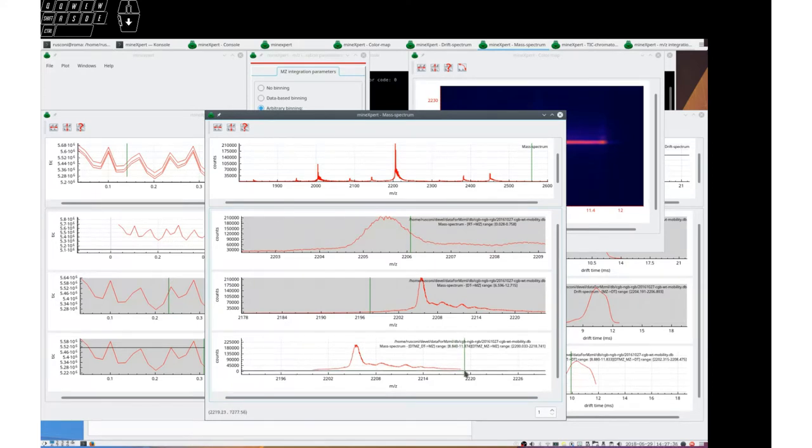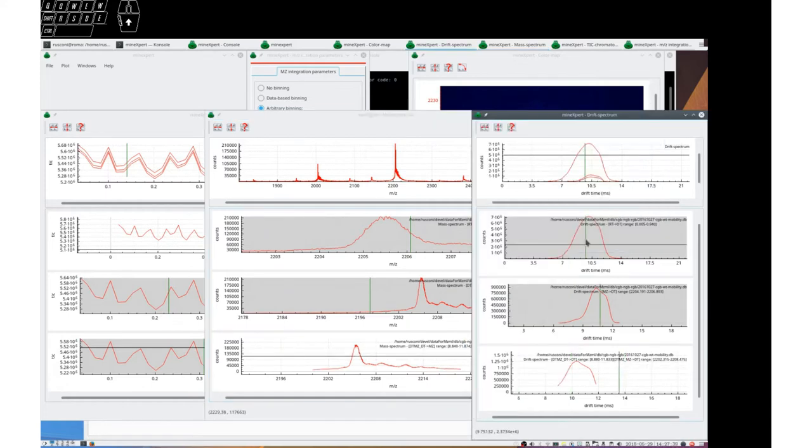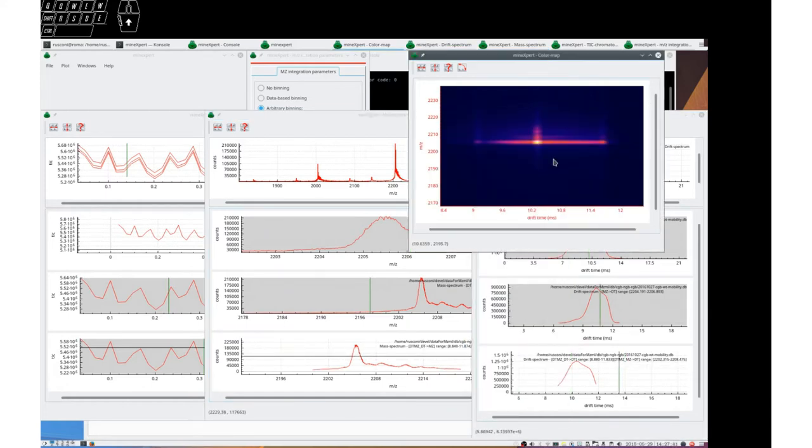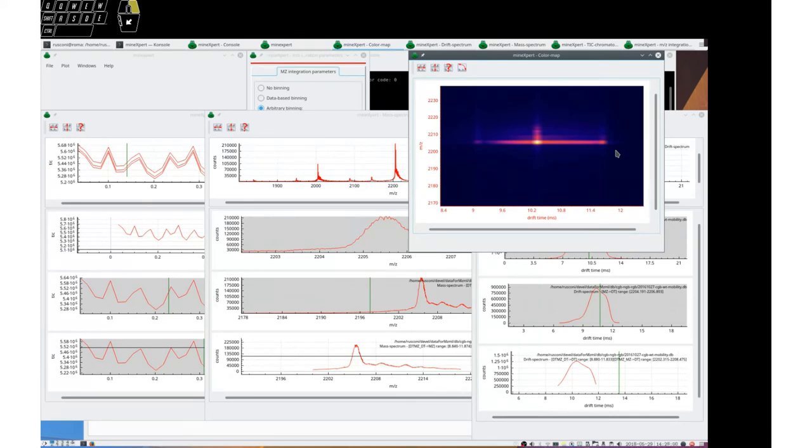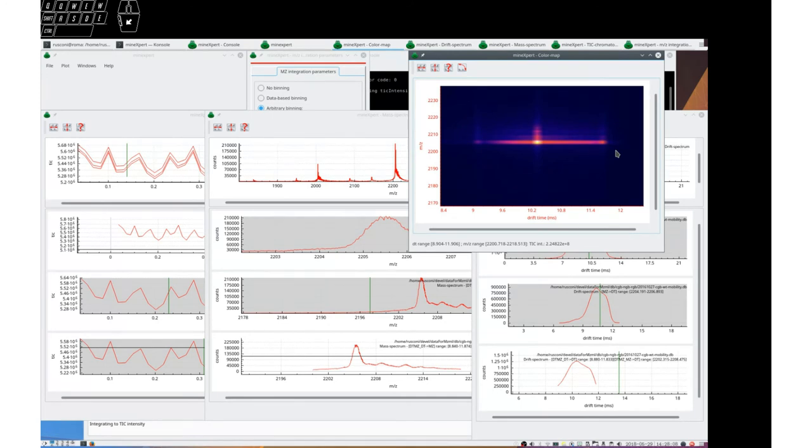So these are the integrations. Remember, if you want to integrate to a TIC intensity, you can do it by pressing the I key. But in between the moment you release the mouse button and the moment you read the intensity value, you must not move. Otherwise, the label changes and the intensity value gets lost. There we are, 2.2 exponent 8. Thank you.